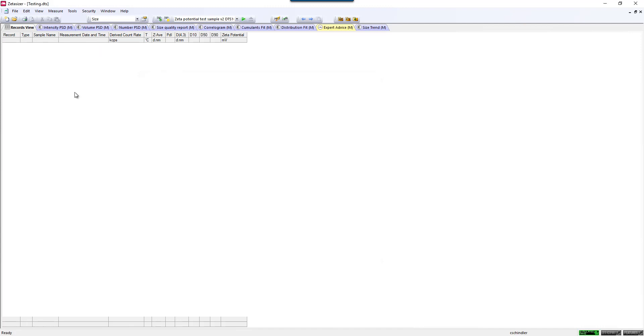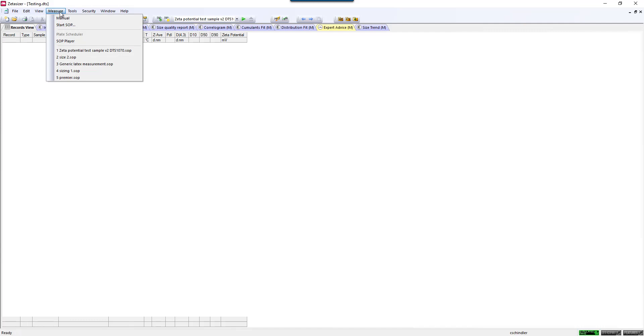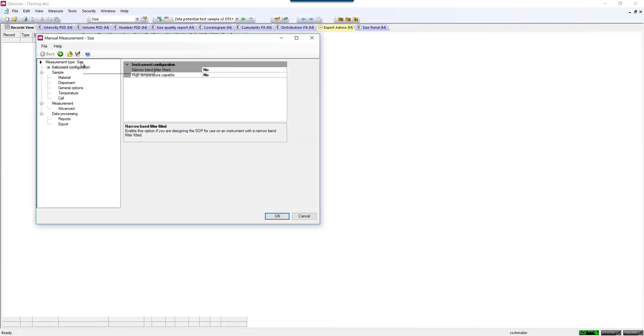To write your own Zeta Potential SOP, you can go to Measure, Manual, and then select the measurement type. In this case, we would be making a Zeta Potential measurement.